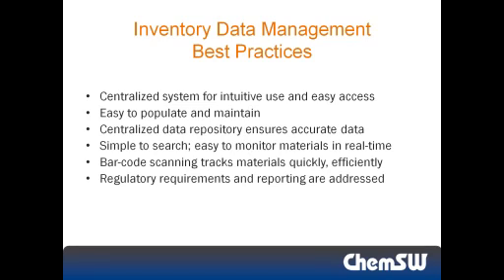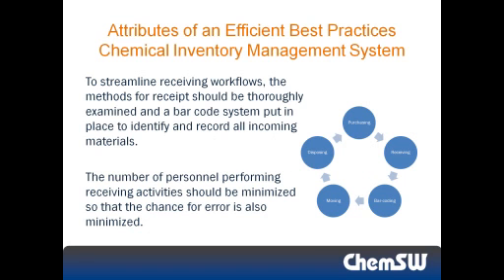Organizations must also include, along with the technology, industry best practices, which include a centralized receiving system and a limited, small group for managing the chemical inventory. That's from receive all the way through to disposal. And what that does is it takes away the opportunity for highly paid research personnel actually doing the menial tasks of chemical inventory management.